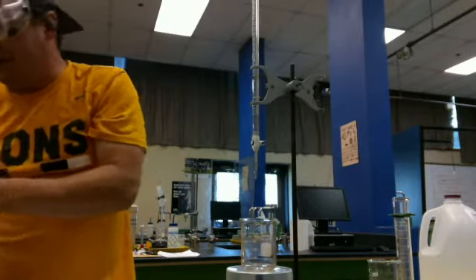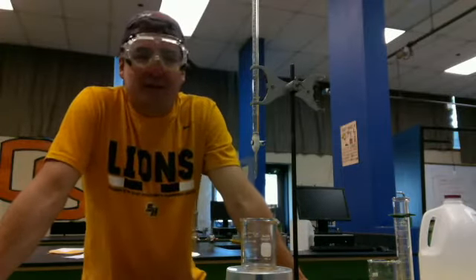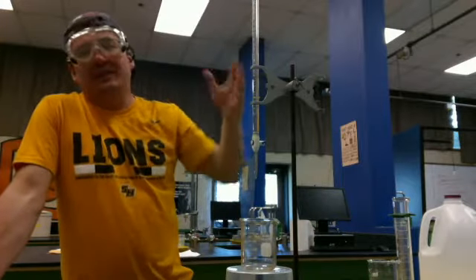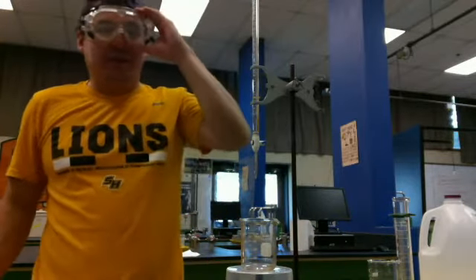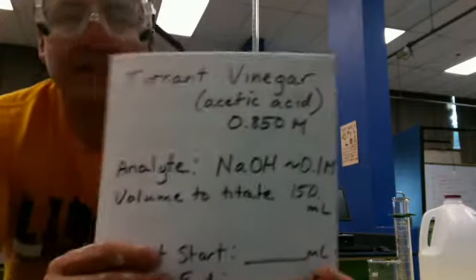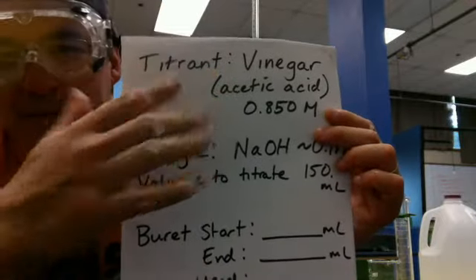So I just have a little glass funnel to help me fill it. Again, if you were in school, we would be doing a lot of these. It is a very important technique, and it's kind of fun. So I've got the titrant, what I'm titrating with, or I'm using. This is my vinegar. Now, vinegar, I haven't told you this until now. The stuff inside, oh I'm sorry, I have been painting all morning.